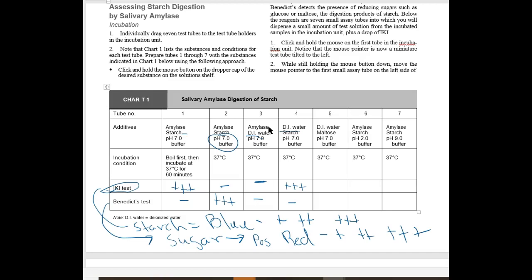And sugar is what we really care about because this is the product of our enzymatic reaction. So looking at this here, we know that all that sugar is there because the enzyme digested the starch and not because somebody spiked our pH 7 buffer with sugar accidentally or something like that. So those are called negative controls. They test negative for what you want so that when you do get what you want, you know why you got it. You can trust your positive results. They are not false positives. This one we don't care about maltose.